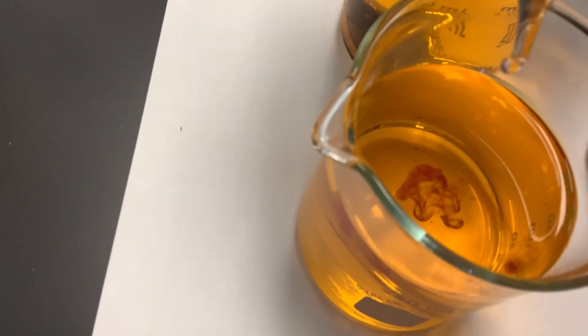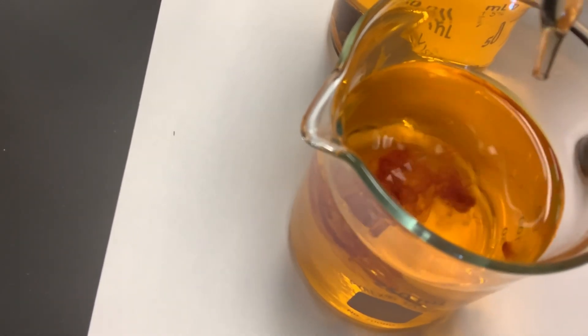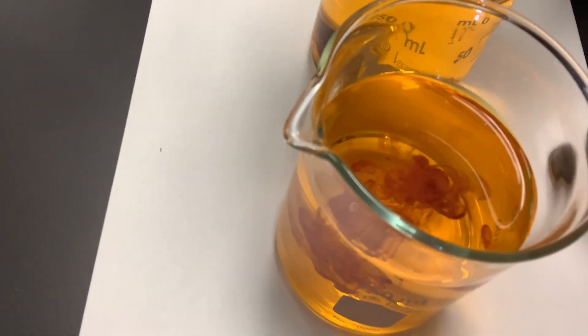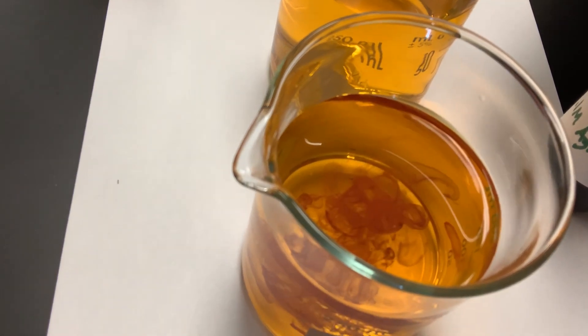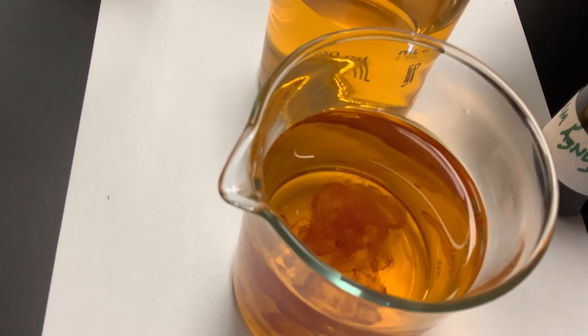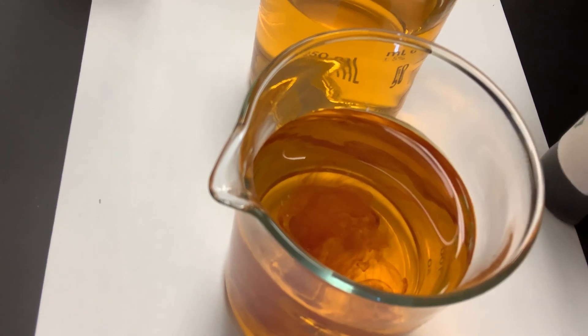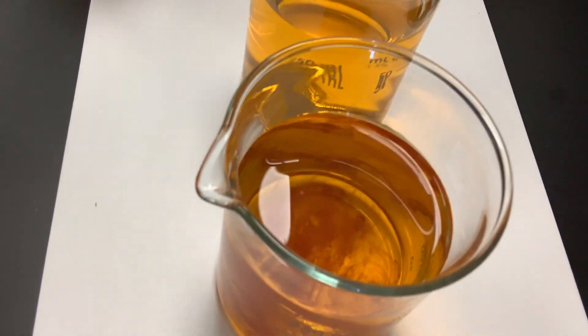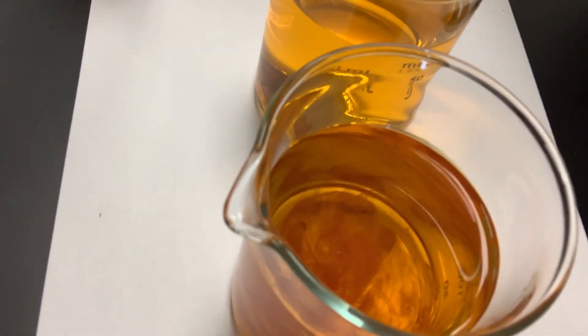It looks almost blood red. We'll put a few drops in there. There we go. And that now becomes a heterogeneous mixture because we have a solid in the liquid. We have two different phases there. And it's suspended in there.